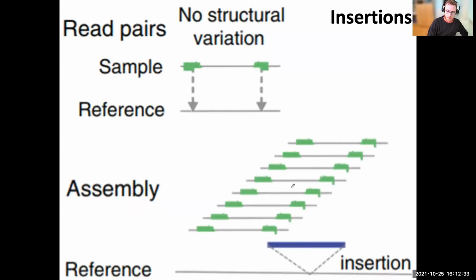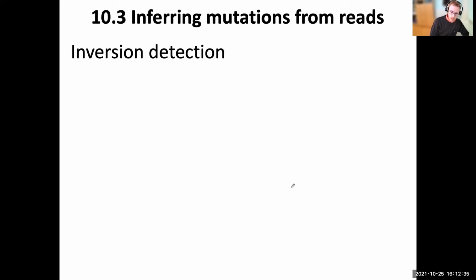If you think about an insertion, it is simply the same diagram as I showed you there. And then we think about more complex variations, such as an inversion. So in an inversion, we may have a particular sample where the reads from which it is sampled face the wrong way. So B here has a 5' to 3' for the reference.